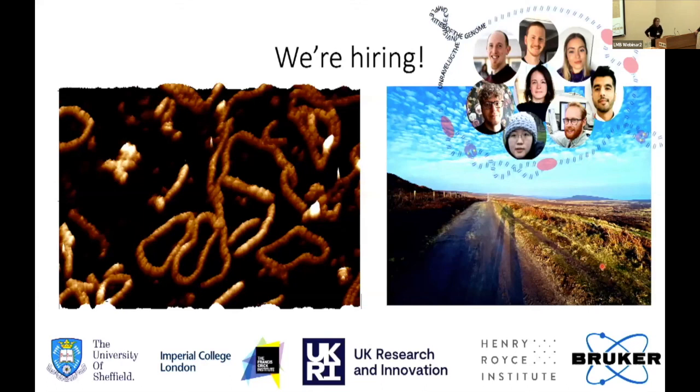So the question is, have you tried using this technique to measure secondary structure of mRNA? And if you have, how does it compare with the predicted structures? So we're doing some really exciting RNA work, lots of which I can't really talk about, but I hope to be able to talk about very soon. Next year, yeah. It is a great technique for looking at RNA.